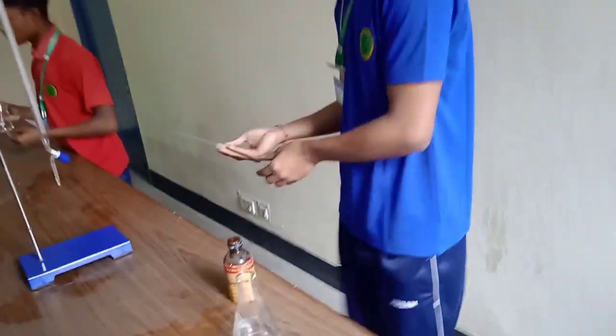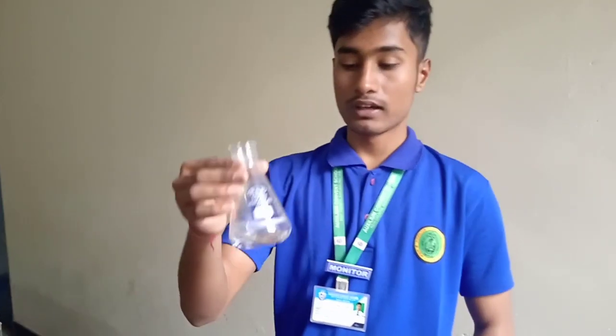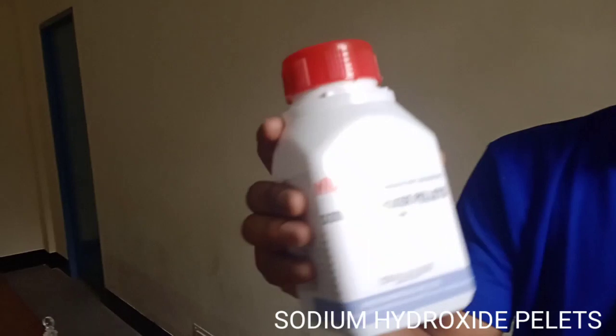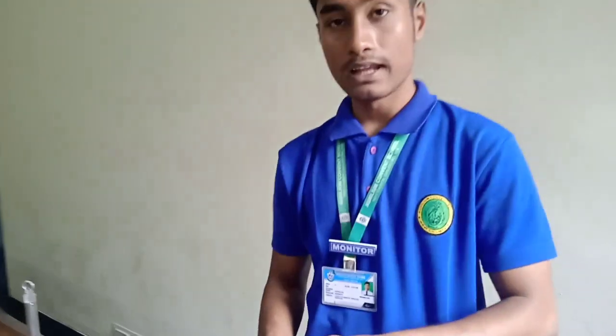As you can see we have added 3 drops of phenolphthalein, so the solution is prepared. We will keep it aside and now we will use sodium hydroxide pellets.